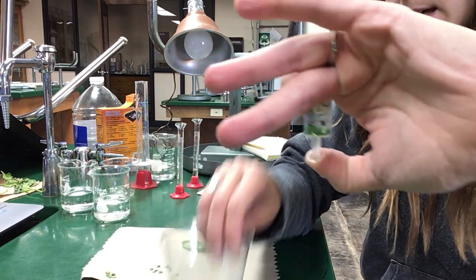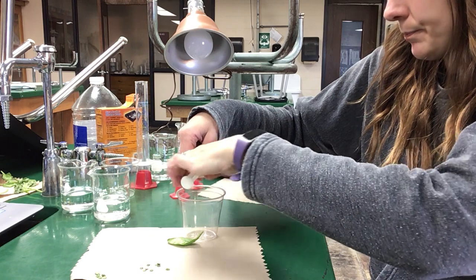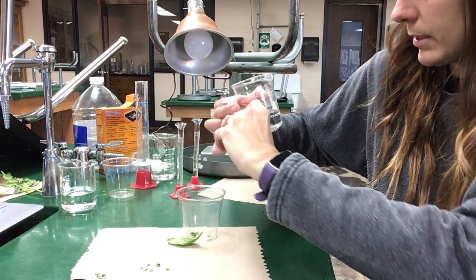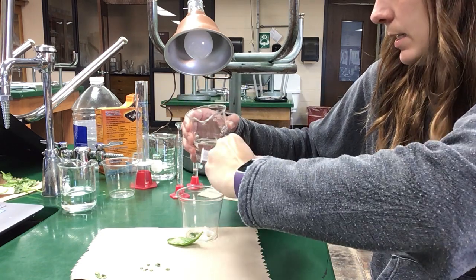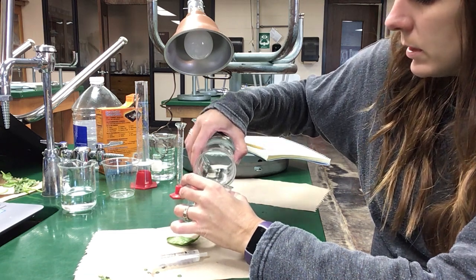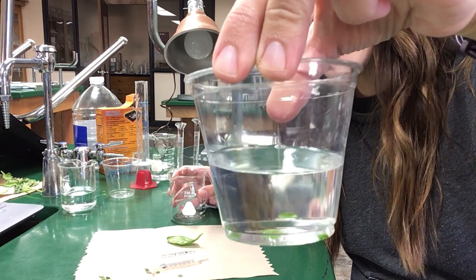So the next thing I do is take a cup, and I'm trying to make it so that you can see all this stuff. I'm gonna dump these into this cup right here. There's a couple in there that are stuck, but we'll take this solution and get those other ones out, because we need to add this bicarbonate solution to that anyway, in which they're going to be floating. If we look at these leaf discs in here, we'll see that all of them are now sunk to the bottom.